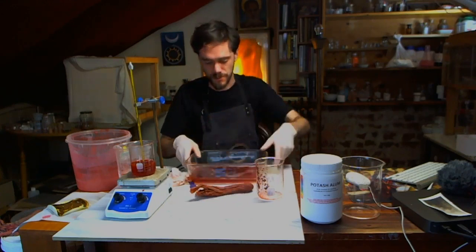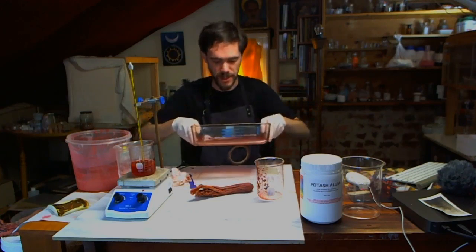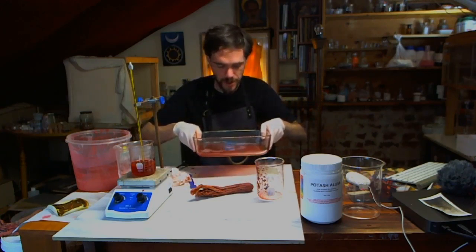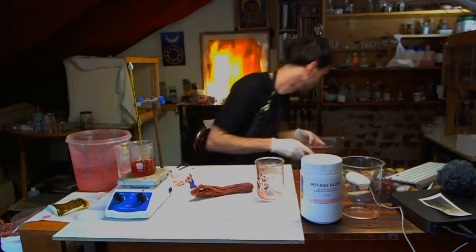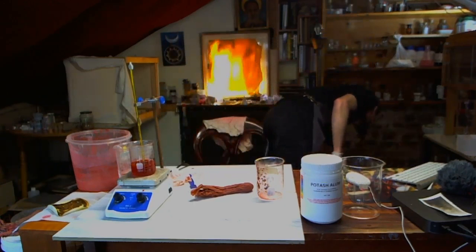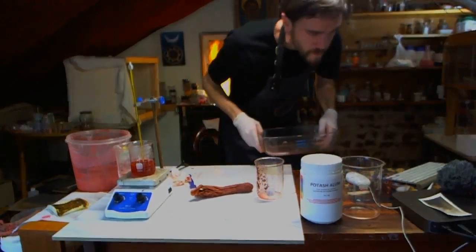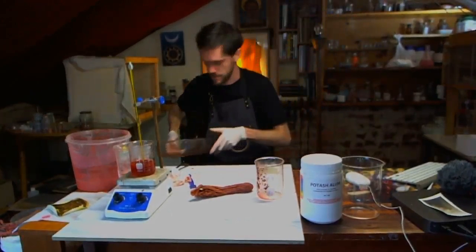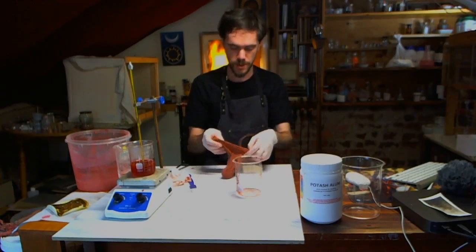But look at that, the liquid we're still getting off is definitely colored. I don't know if we're losing coloring material or if we're just getting rid of junk we don't want. It's not entirely clear at this point. Yeah, I think 30 to 40% is a pretty good yield.